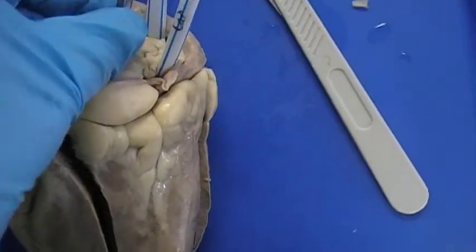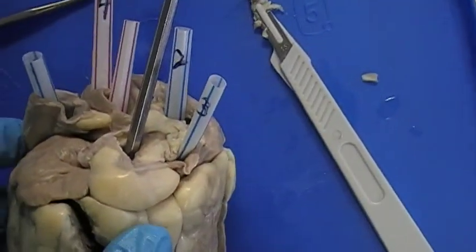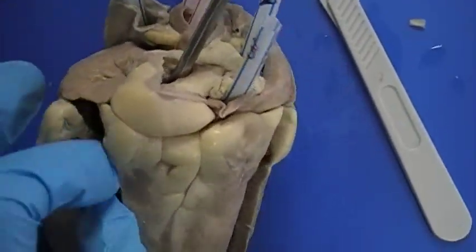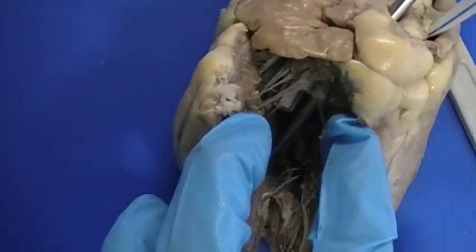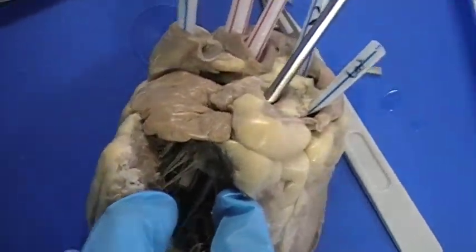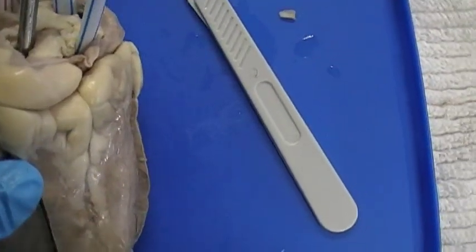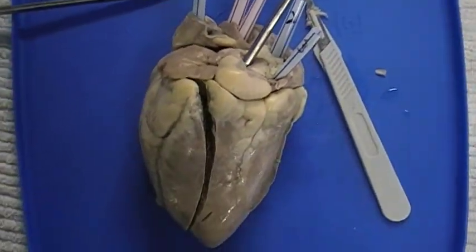And then this rod right here that I'm kind of playing around with, this is the pulmonary vein, and it goes into the left atrium. You can maybe see it in there, sort of. Goes into the left atrium, and it is oxygenated blood. And that ends the outside of the heart.